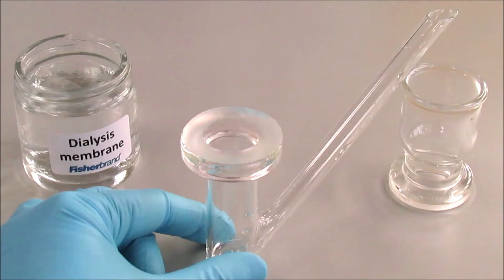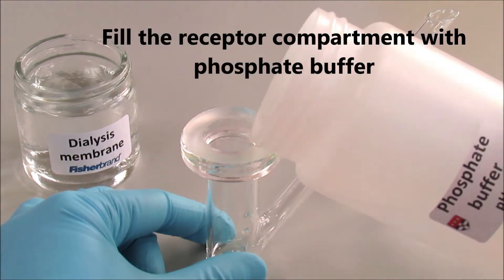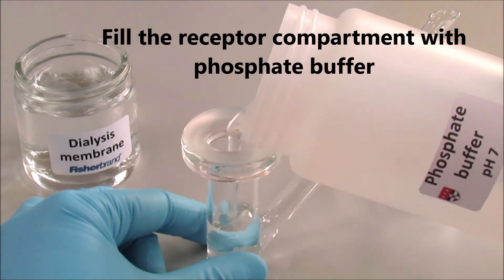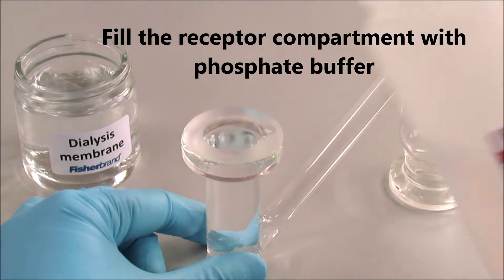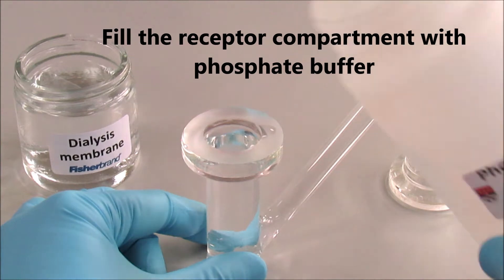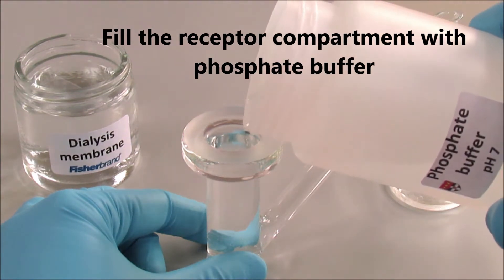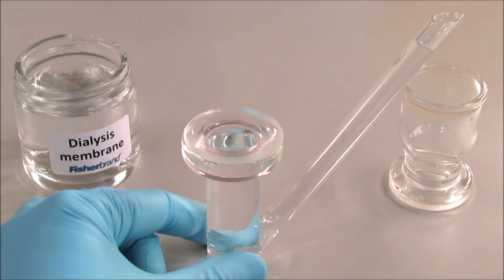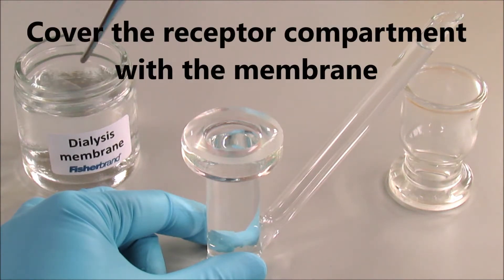Before doing that, we will fill up the receptor compartment with phosphate buffer and we need to make sure that we put a little bit of phosphate buffer on the top. Then we cover the receptor compartment with the membrane, a dialysis membrane made of cellulose.